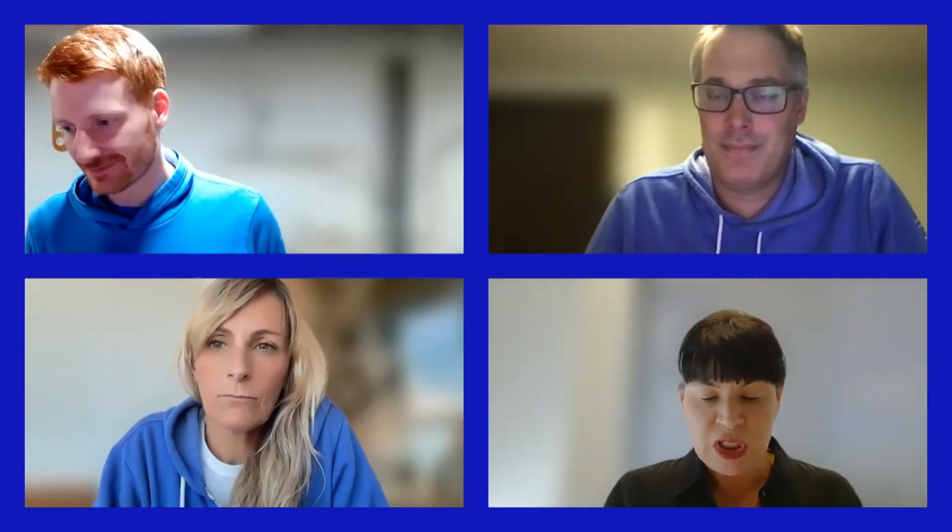That's great. Time for one more question, Wendy. I think that you get the last one here. We have a question that's coming in about any improvements to permissions on workflows. There are projects where they want to share their workflow processes, but they don't want others to change or edit. Is there a way to assign privileges to edit or view the processes we've built in workflow?